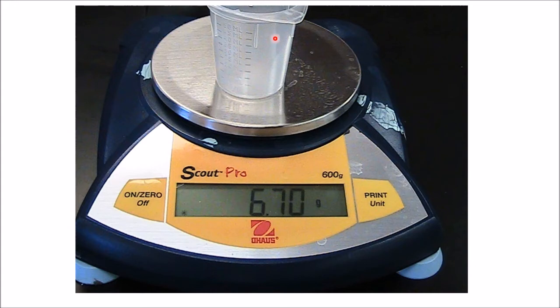Now I've put this plastic beaker on top, and the beaker is there because it's going to hold our spheres. If you laid these spheres on top of the balance, they're liable to roll off somewhere, and we'd have spheres all over the place and it'd be a mess. So we put the beaker on top, but I want to make sure that I get the mass of just the balls.